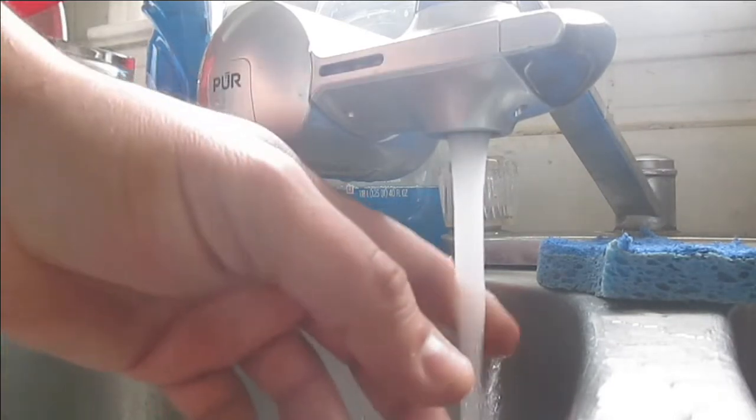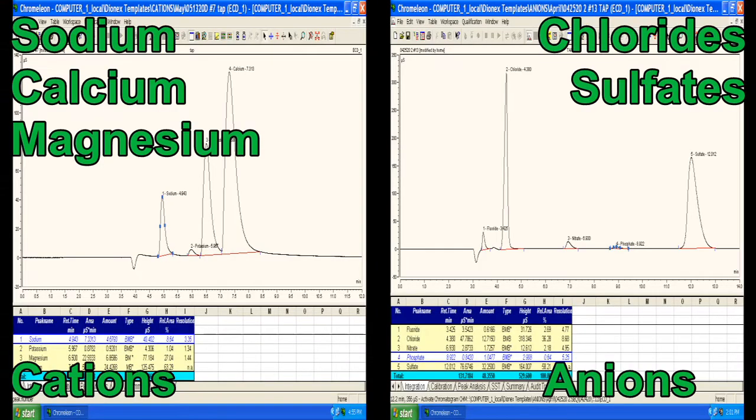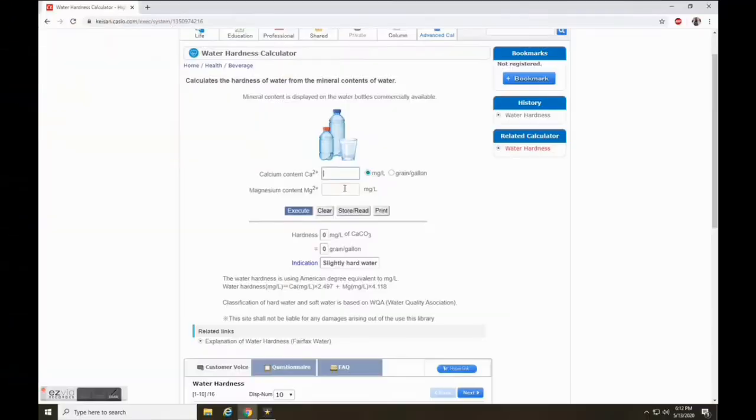This gives us a good idea of what kind of salts are present in this water. Furthermore, with calcium and magnesium, I can now calculate the hardness, and this gives us a value of 89, which is moderately hard water.